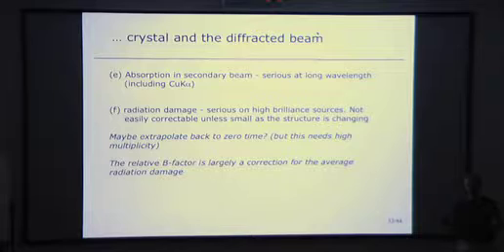Radiation damage, again, is something you tend not to see so much on home sources. I think on the FRE downstairs people do see it. Okay. Unless you've only got small changes, this can be very difficult to correct for. Also, of course, as your crystal is changing, the structure of the molecules inside it is changing as well. So you may want to stop your data collection before you get too far.